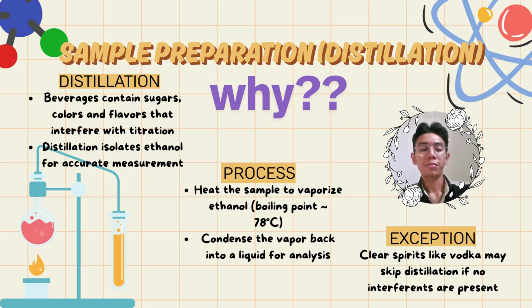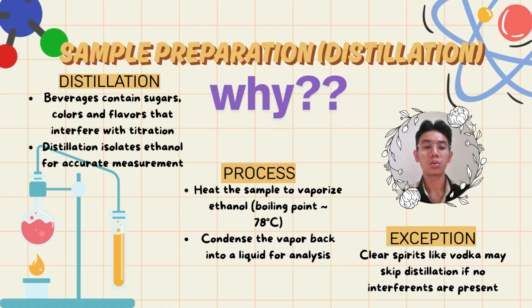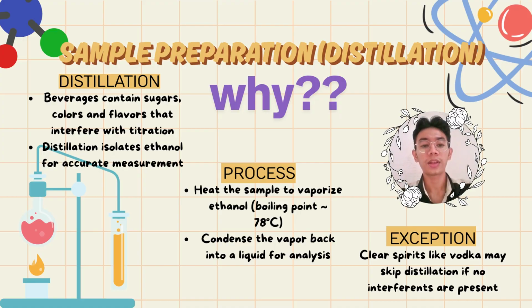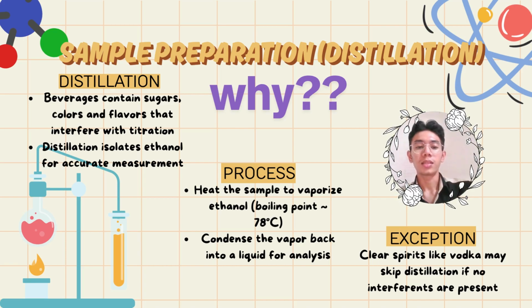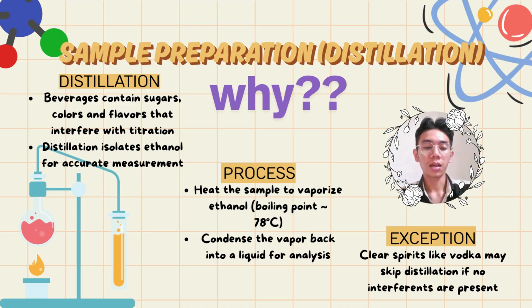And for the sample preparation, first we distill the beverage to isolate ethanol, removing sugars and flavors that could interfere. Distillation boils ethanol at 78 degrees Celsius, condensing it into a pure form for analysis. Clear spirits like vodka may skip this step.